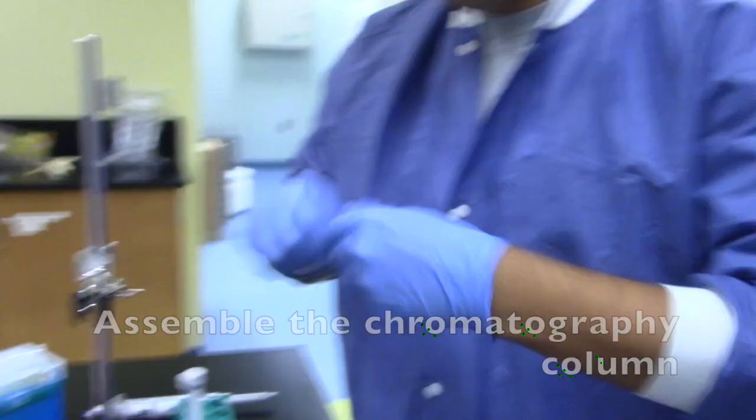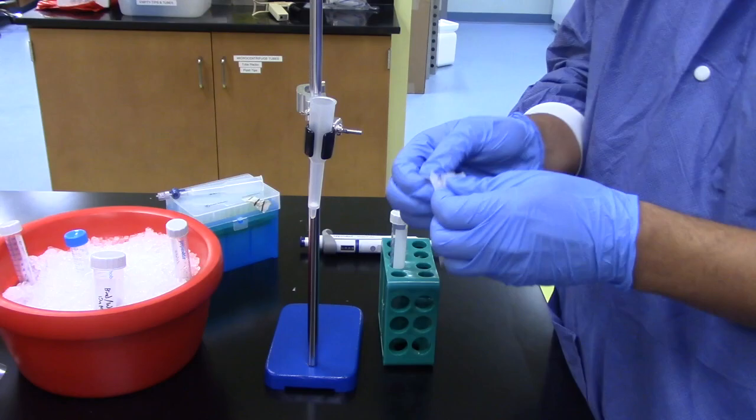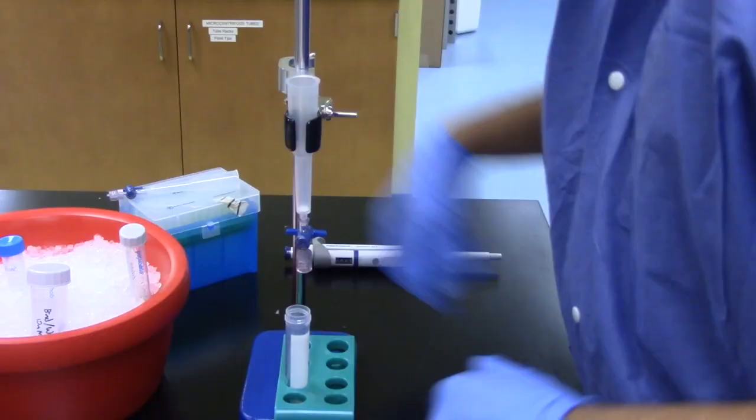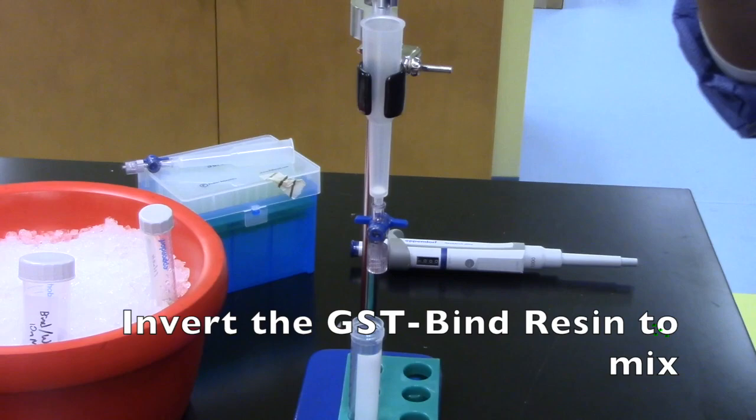Assemble the chromatography column. Invert the GST Bind Resin to mix and add the slurry to the column.